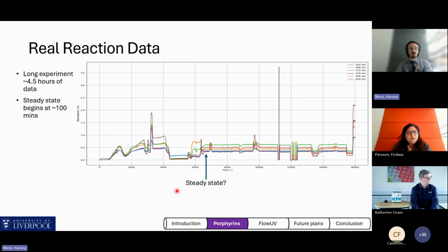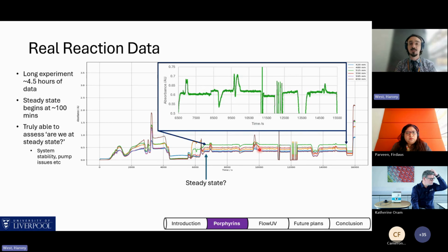The second thing that we can see is the appearance of what we refer to as the steady state conditions, indicated by this lovely flat profile for each of our responses. However, if we zoom into that information and focus on our most intense response at 515 nanometers, despite the distant view that these may be lovely flat lines, we can see that our system never truly achieves a steady state condition.